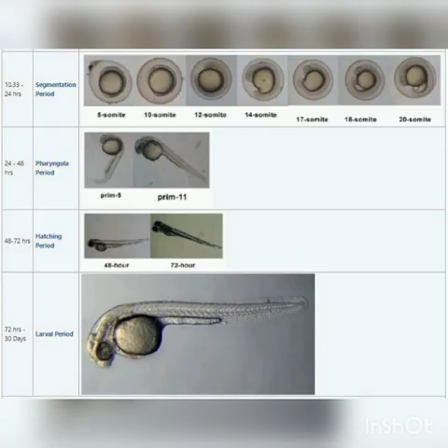So to conclude this virtual laboratory session, we discussed the 8 different developmental stages of zebrafish, and every single stage has its own peculiar features.